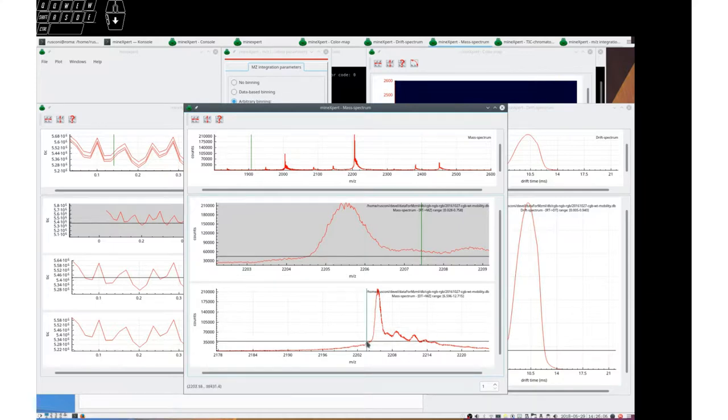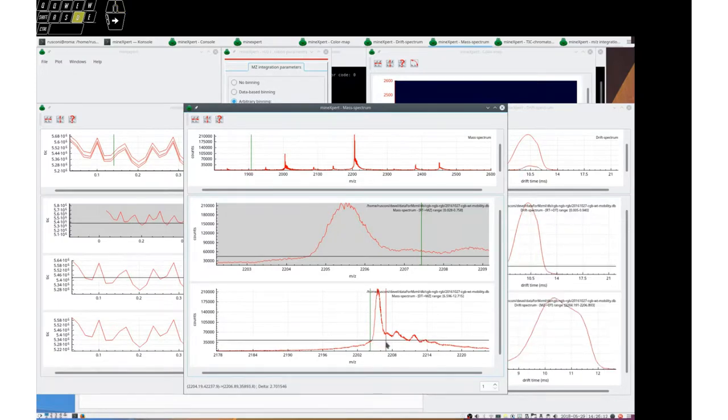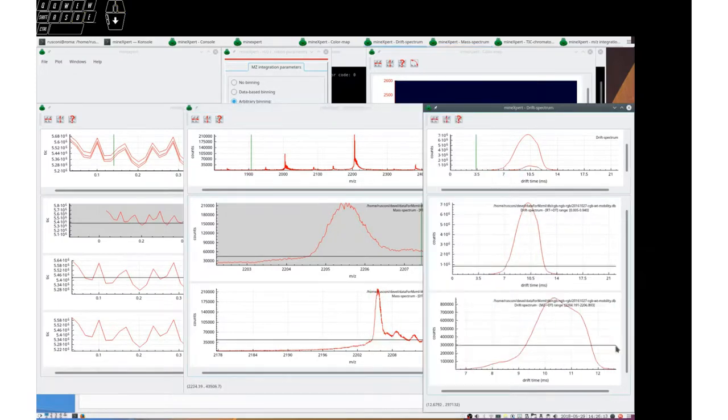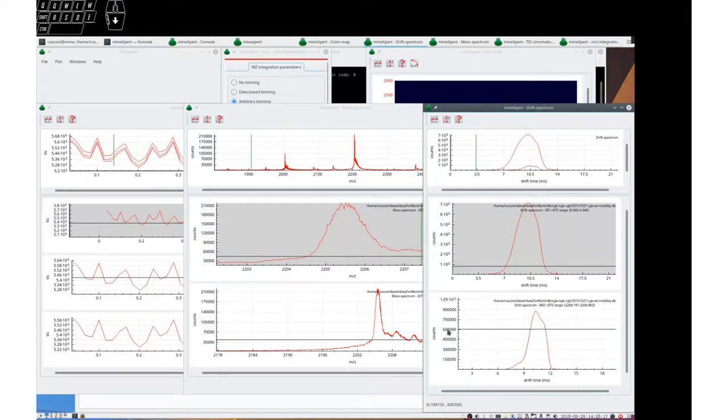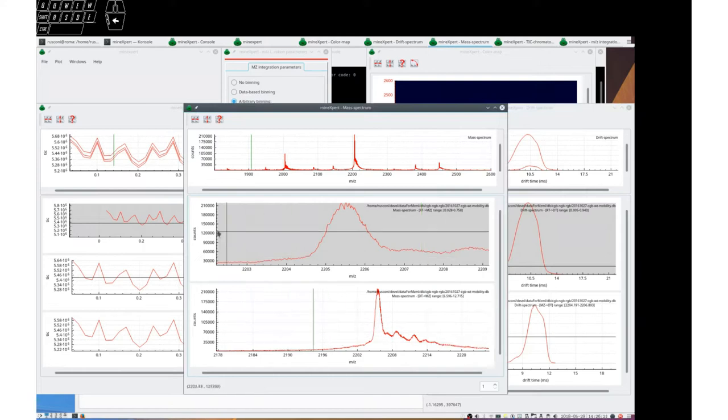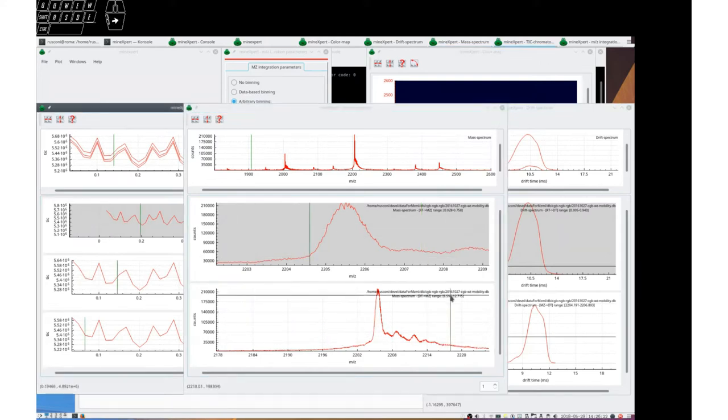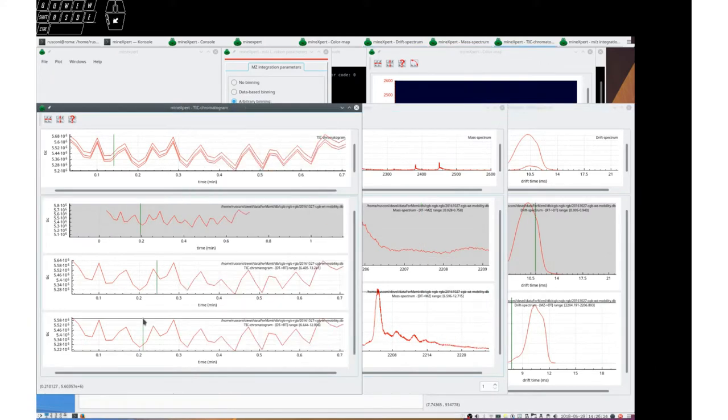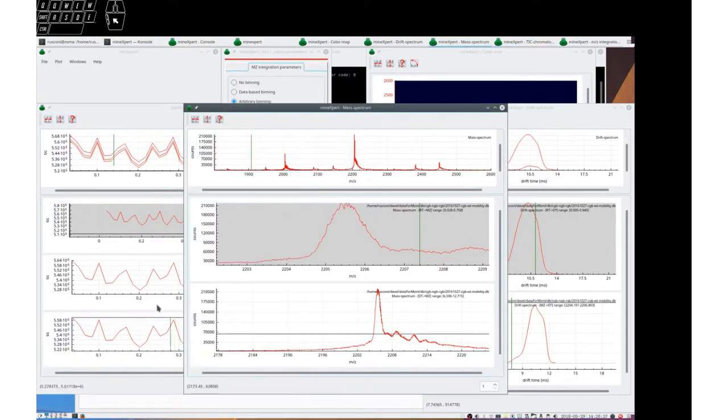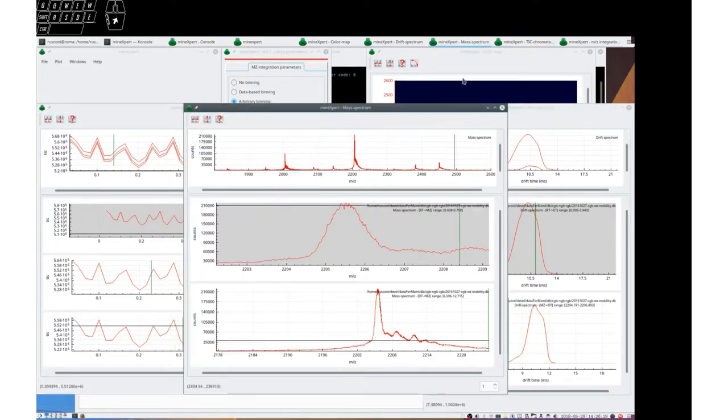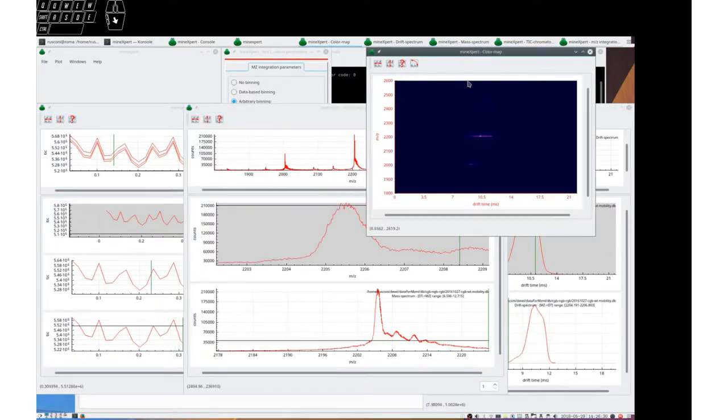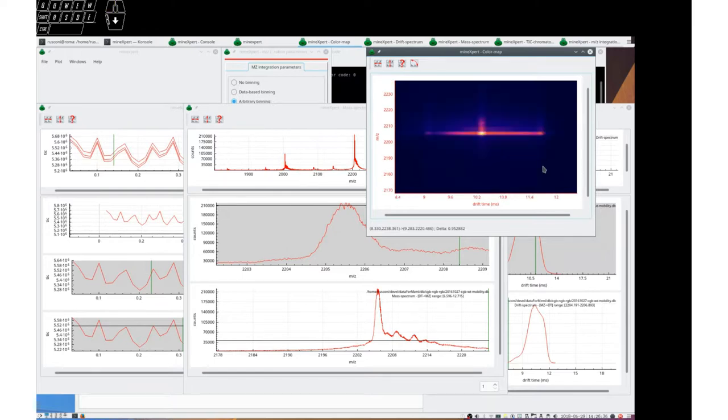And we can reintegrate to a drift spectrum for only this species. So it is possible to integrate in any direction. The only limitation we have at the moment is that we cannot integrate to a color map. We can only integrate from a color map.